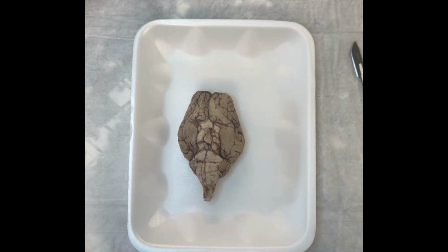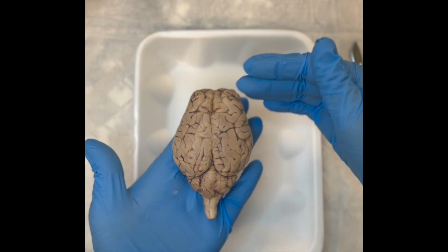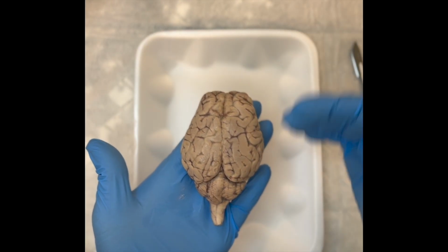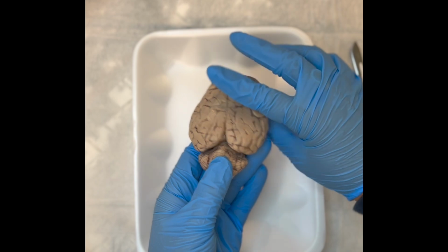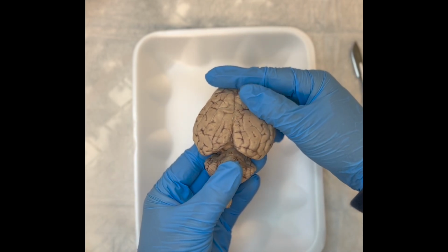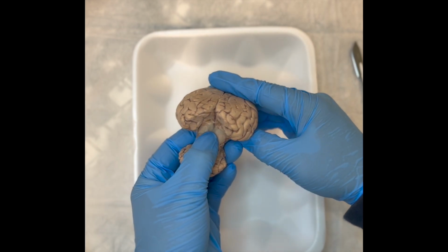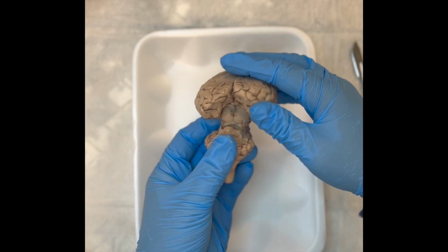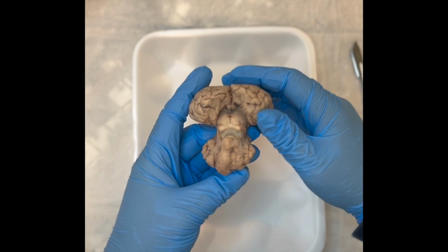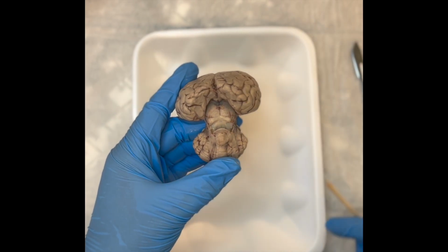One way to examine cool features of the midbrain is to take your sheep brain, flip it over in our starting position, our rostral and caudal, anterior, posterior. I want you to take your thumb and put it on the cerebellum like this, your other hand toward the front of the cerebrum, and you're going to kind of fold this structure down like this. So I've even stuck my thumb in here even further into the midbrain, and I'm causing some separation here of our brainstem, our cerebrum, and the cerebellum.